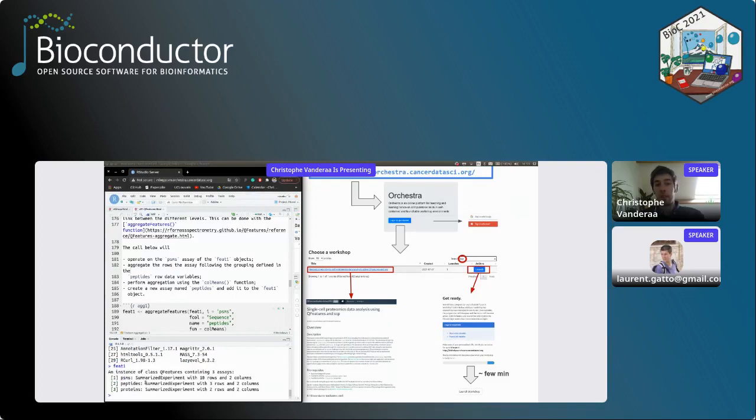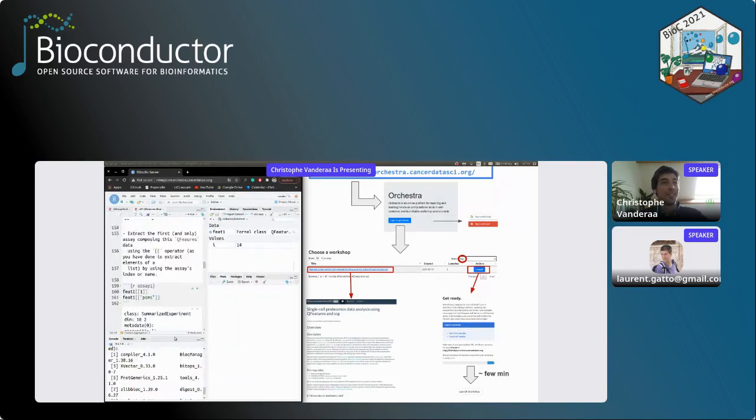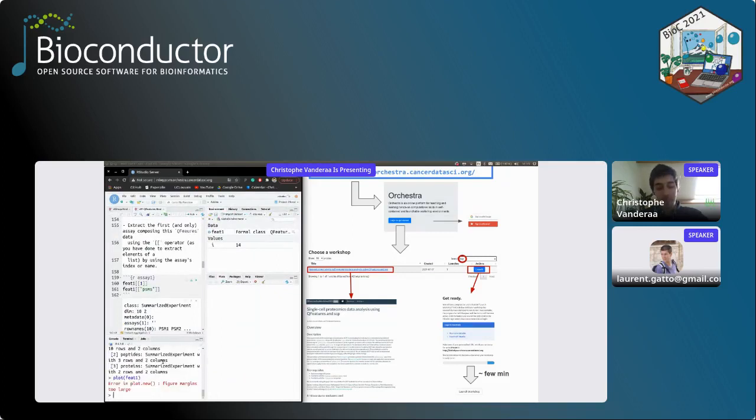Again, it's exactly the same, just what I showed from the compound vignette. But we can also plot the QFeatures object. And so if we do this, sorry if it's all a bit compact. I'll remove this screen on the right once I'm done with this vignette. Okay, and here we see a graphical overview of our QFeatures object. So we have the PSMs that are aggregated to peptides, given by the directions of the arrows, and peptides go to proteins.